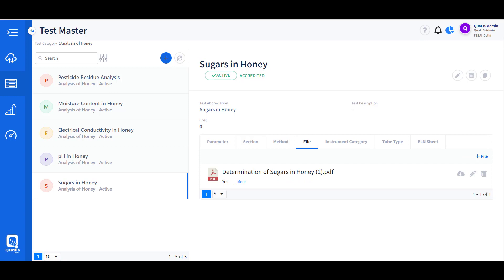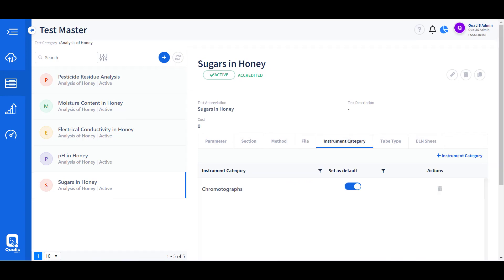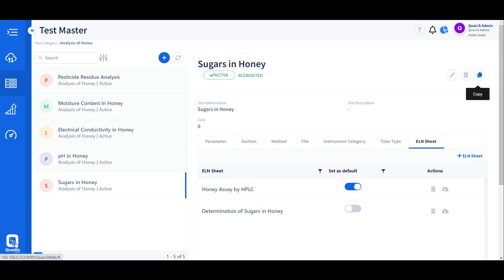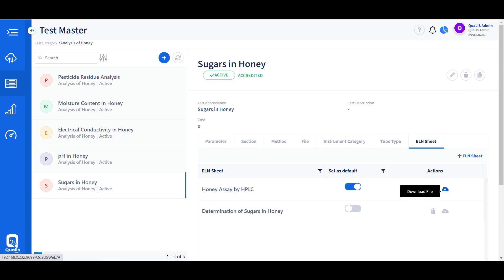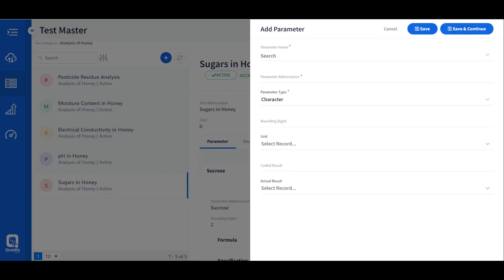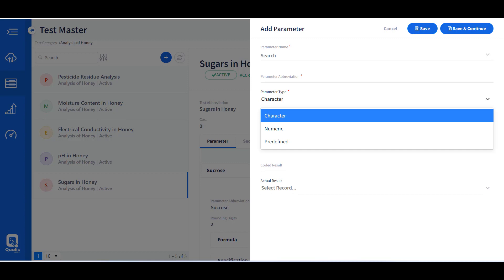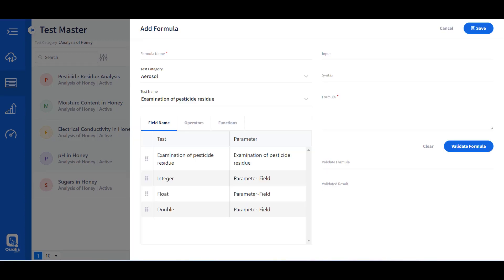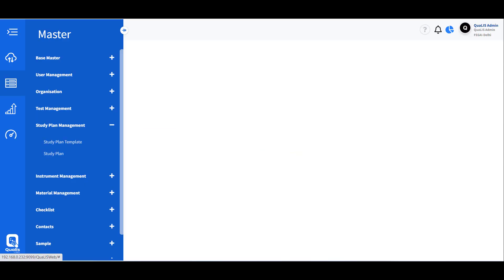Different SOPs can be associated and referred to while working. Instrument categories allow you to define instrument integration, and the electronic lab notebook can also be associated to define test data sheets for conducting and capturing test details. While defining parameters, they can be defined as characters, numbers, or predefined values. Complex formulas can also be associated with the test and validated before they are released.